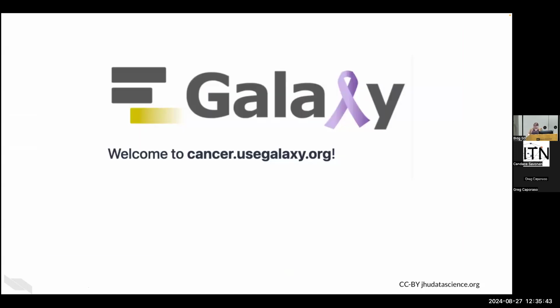One of the other servers is Cancer Galaxy, which is the server that you will be using today with Hannah as you walk through exploring your microbiome data. And Cancer Galaxy is an example of specialized servers that Galaxy does apart from Galaxy Main, where it's bringing together tools that are useful for cancer analysis or specific to cancer analysis. You don't have to be working with cancer data to use Cancer Galaxy, but it is a specialized server.